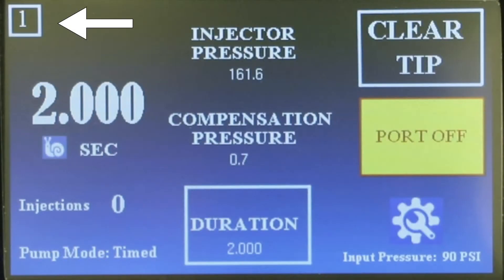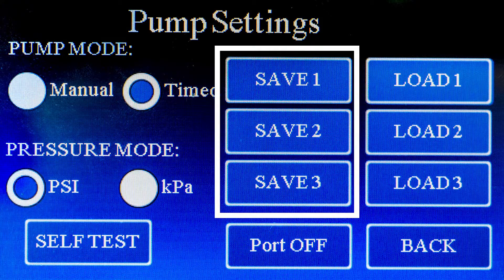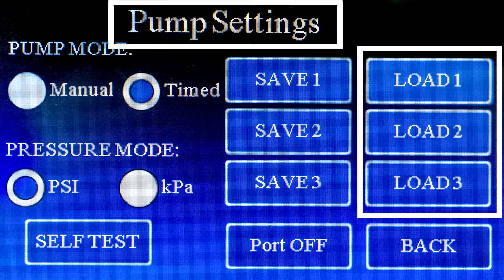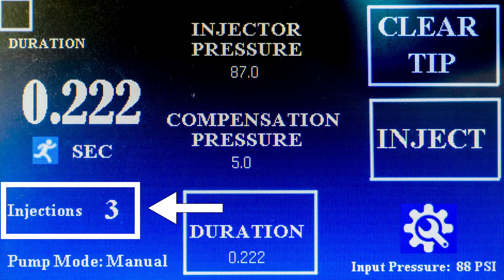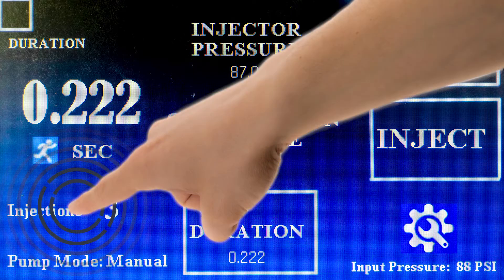This number indicates the loaded protocol. You are able to save up to three protocols and call them up in the settings screen. Every time the injector is activated, it will increment the injection counter. Reset this counter by simply touching it.